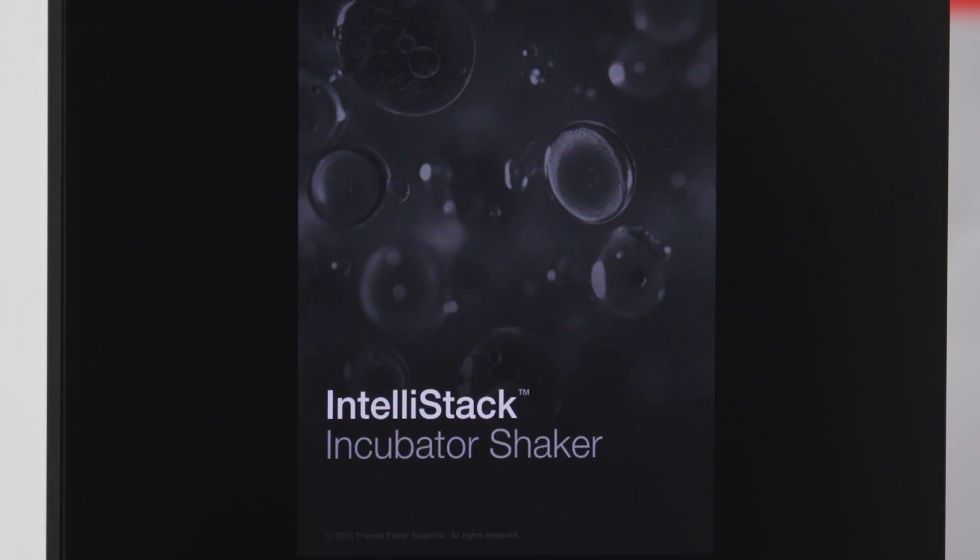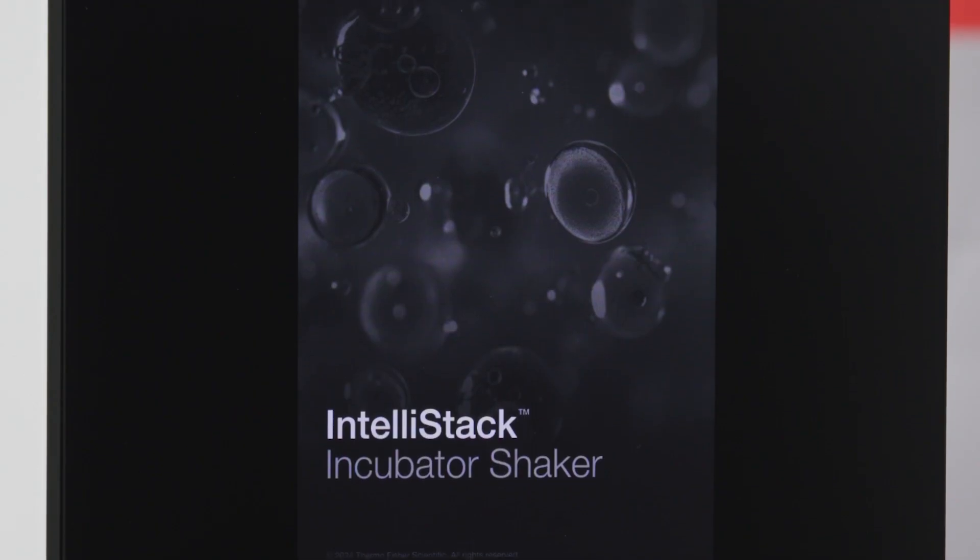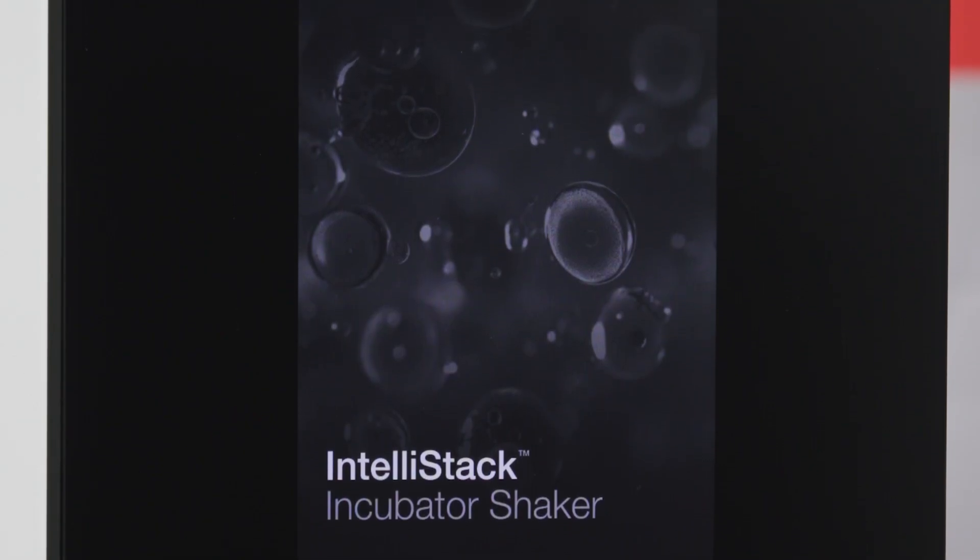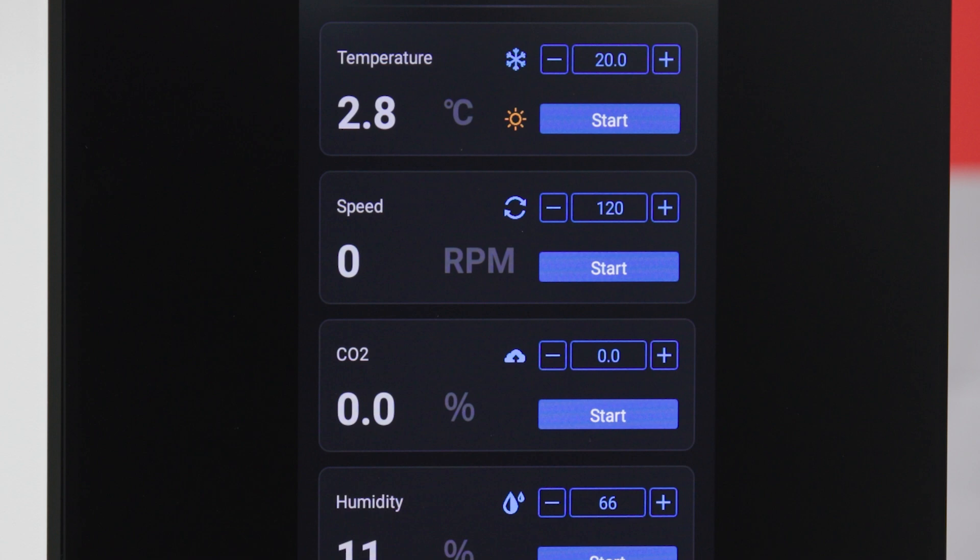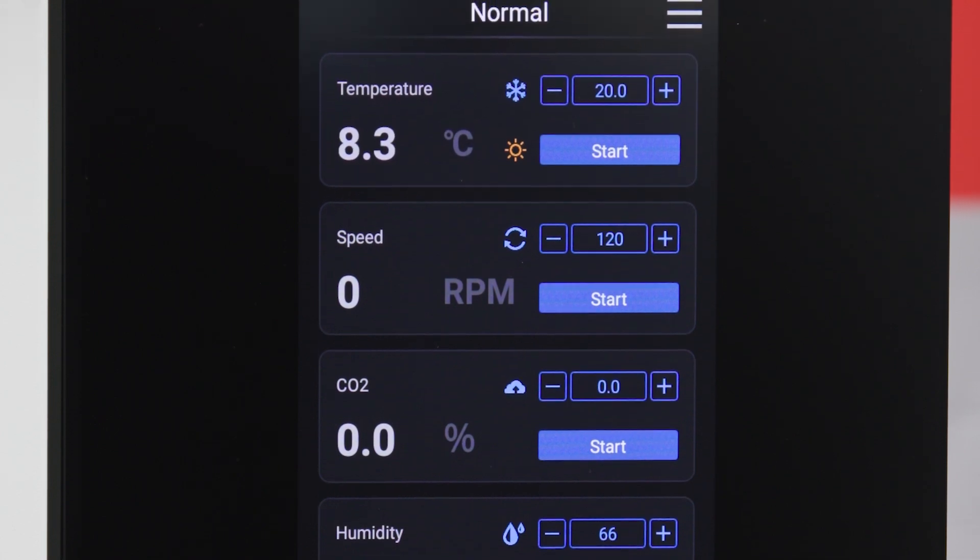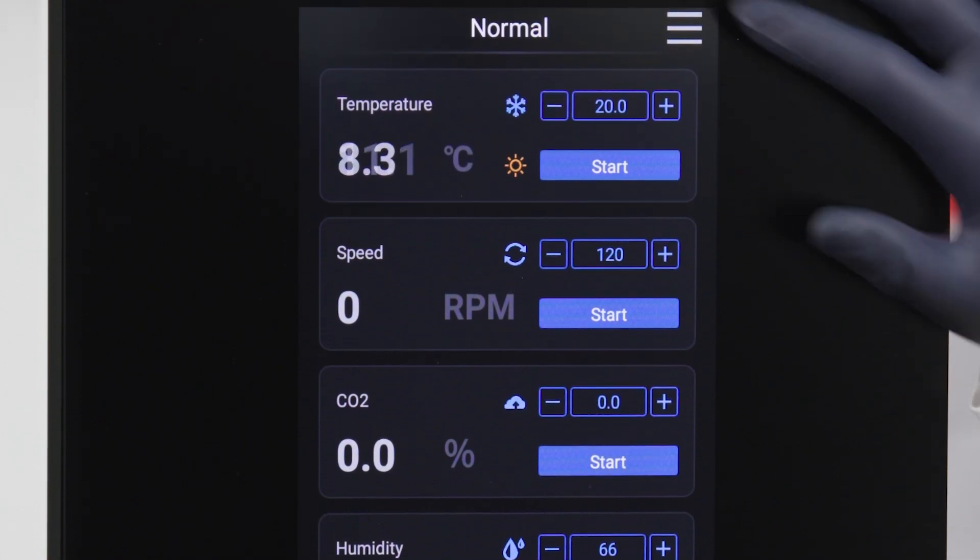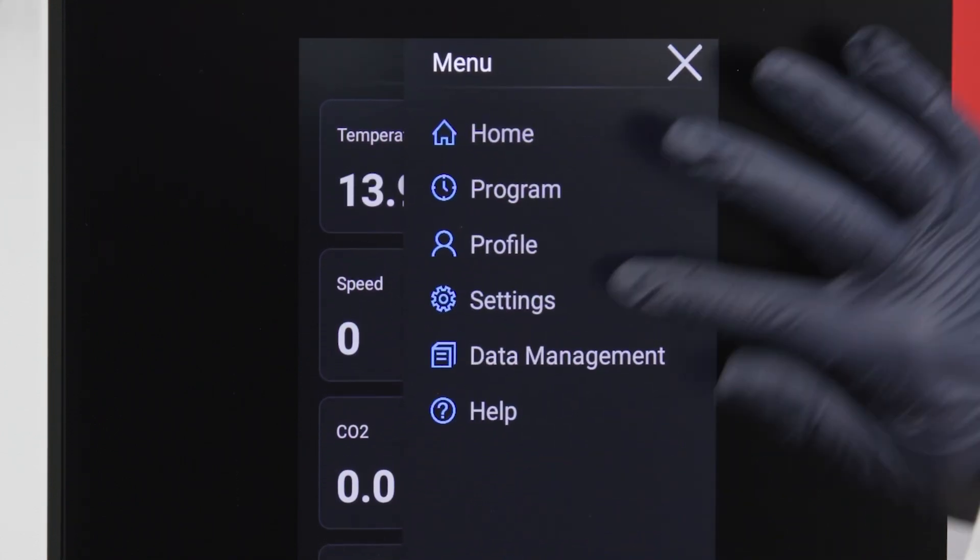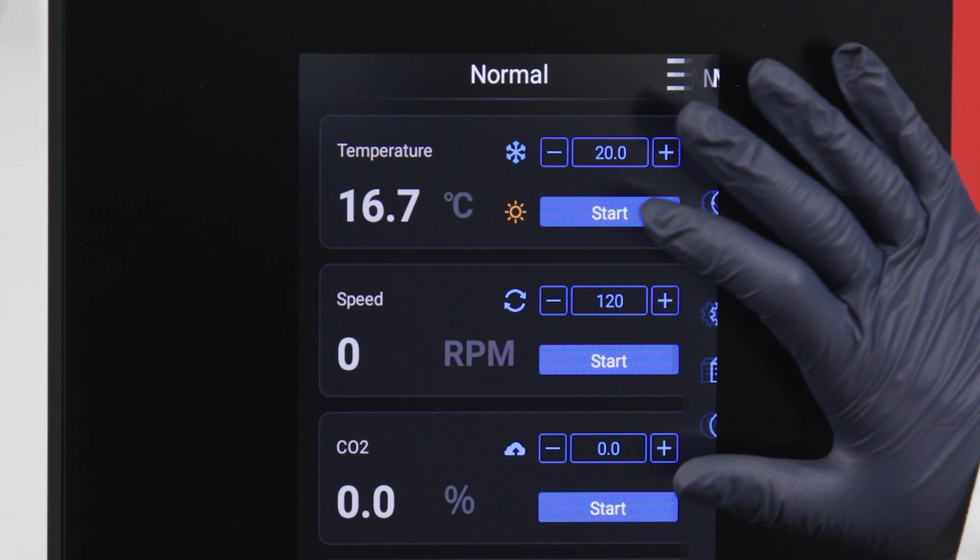Okay, let's get started. First, we'll look at the touch program's main interface and how to view the shaker's current performance and settings and how to adjust those settings to suit your application.